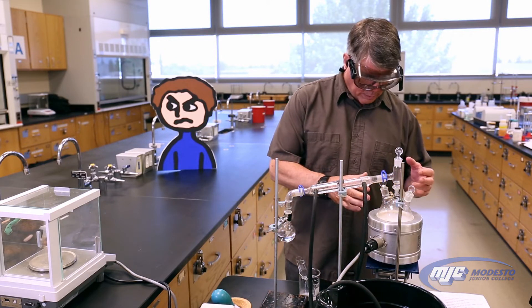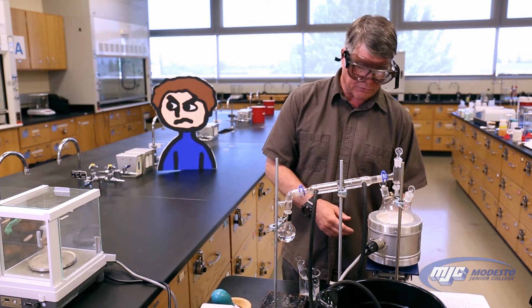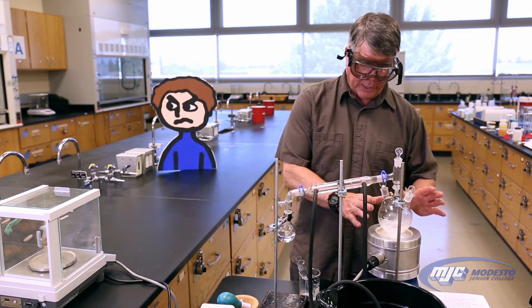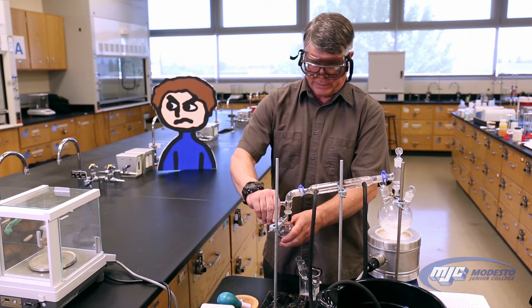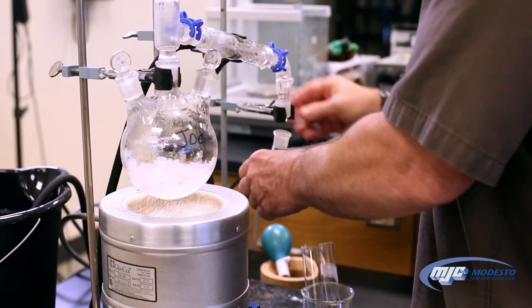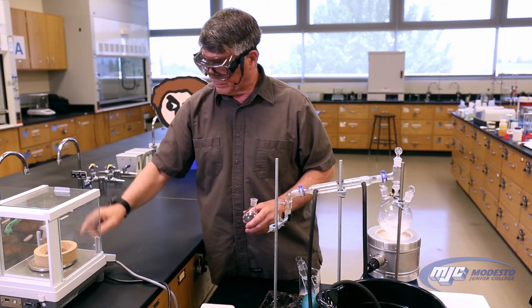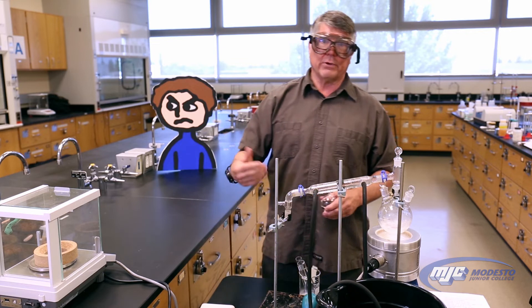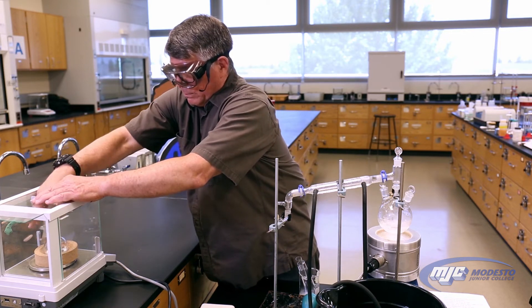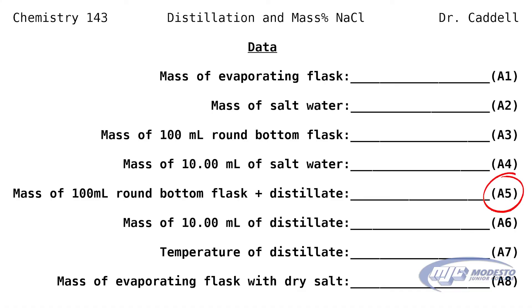So now it's been distilling for a while and almost all of the liquid has distilled over into the 100 milliliter round bottom flask. So what we do is we lower the lab jack — this takes the heat away immediately from the distillation flask. Turn off the power. We're going to let this cool down because it's still hot. At this point, we take off the 100 milliliter round bottom flask and we're going to weigh this to see how much it weighs with the distilled water. Tare the balance with the cork ring, then put that 100 milliliter round bottom flask with the water in it. Record this mass three places past the decimal, little g for grams. This is your A5.